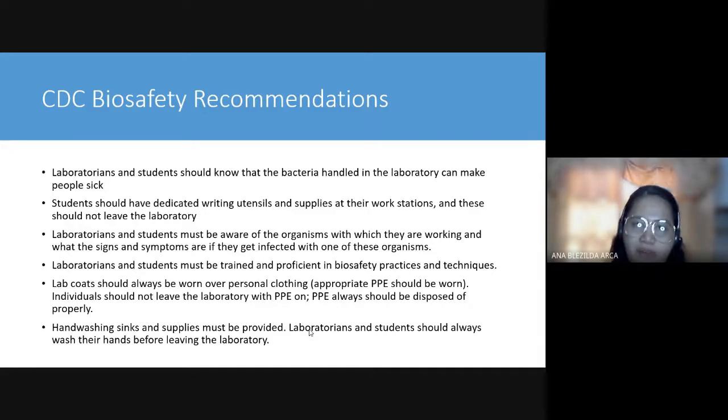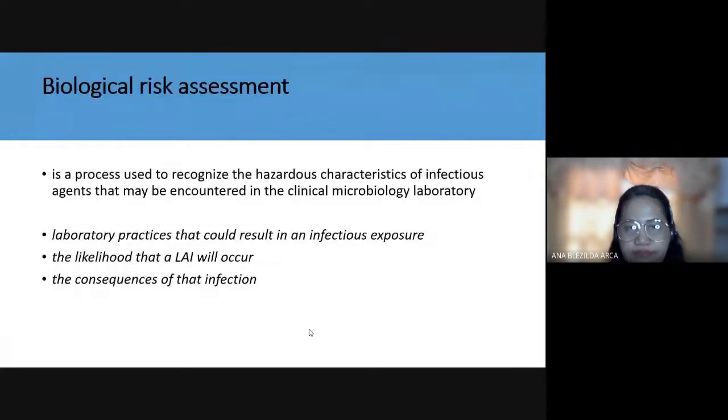Pangalawa, dapat meron ka mga supplies only used in the laboratory, such as writing utensils and supplies at their workstation. Again, you must be aware of the organism that you are going to work for and look for the signs and symptoms of that microorganism. And you must also be trained for the biosafety practices and techniques. You must always wear your PPE and always perform hand washing.